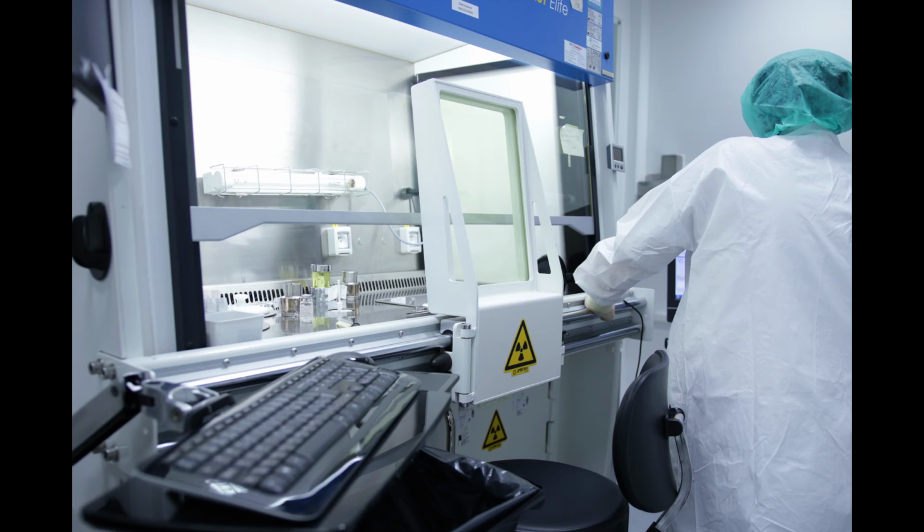Some further requirements, depending on where you're operating and the specific requirements of that particular legislative structure, may require that rather than wearing a lab coat, you instead have wraparound gowns, scrub suits, and/or coveralls when working within the laboratory.